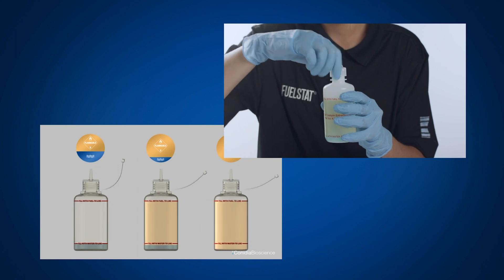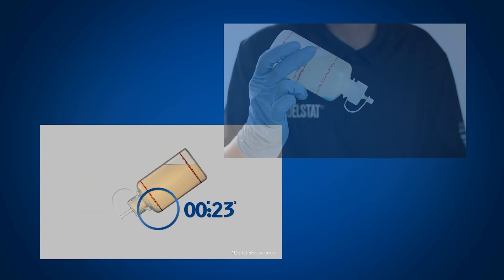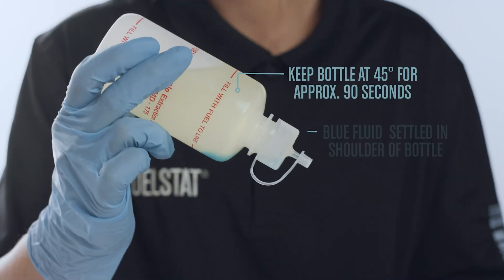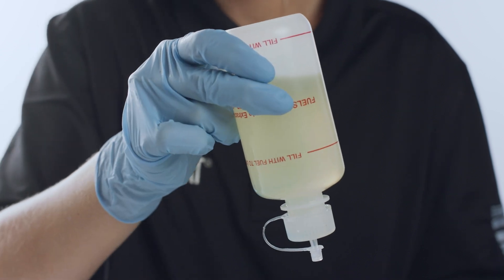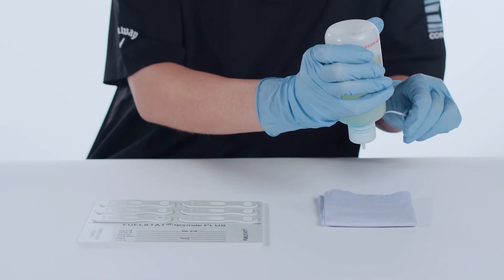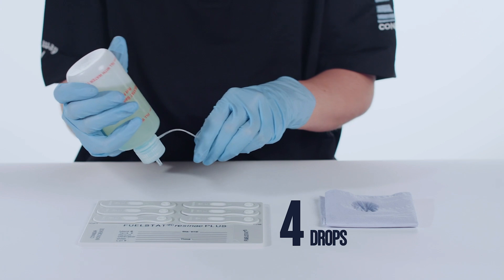Now tighten the dropper cap onto the test bottle and shake for 5 seconds. Invert the test bottle at 45 degrees for approximately 90 seconds to allow the blue fluid to settle out in the shoulder of the bottle. Please note that for a free water phase only test, the blue fluid will not separate out. Now fully invert the bottle and keep it inverted at all times. To ensure that no fuel is trapped in the nozzle, place 4 drops onto a tissue to help ensure that only the blue liquid is transferred onto the FuelStat test plate.